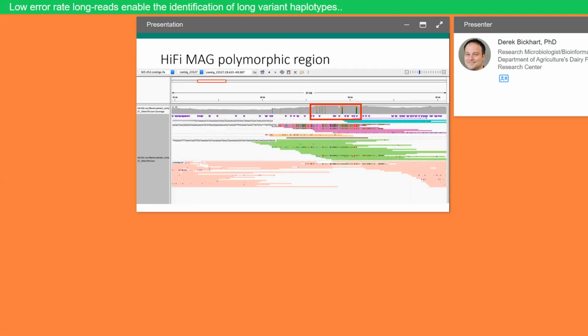A picture's worth 1,000 words, so our collaborators at PacBio helped us in generating these IGV plots. You can see at the top in the red circle, the thick red square, that we actually have depths of coverage of different variant sites indicated by alternate colors. And these are clearly distinguished within the hi-fi data. You can see the alternate allele is patterned here, and the reference is patterned underneath. And these are appreciable depths of coverage that are pretty consistent across the identified variant sites.